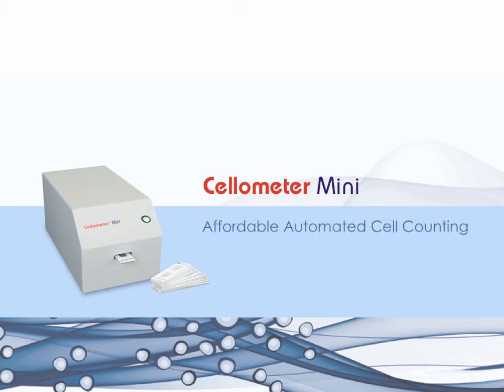The Cellometer Mini — affordable automated cell counting with fast and accurate results.